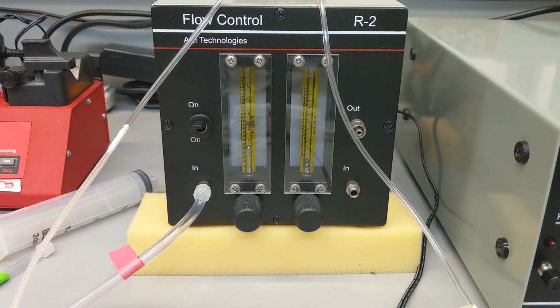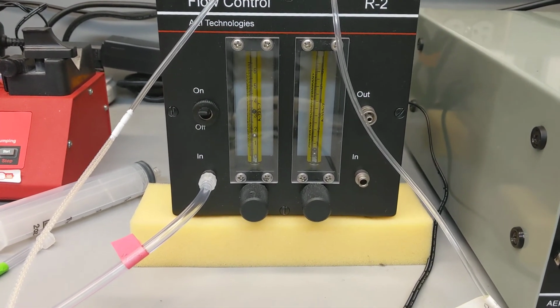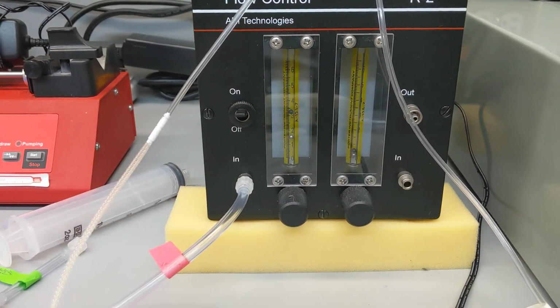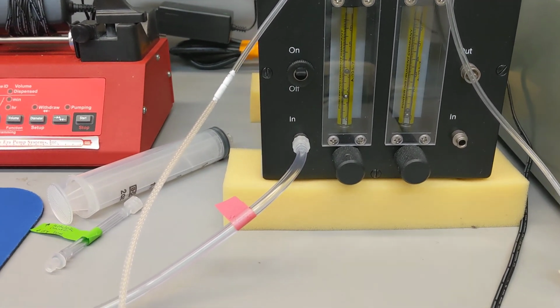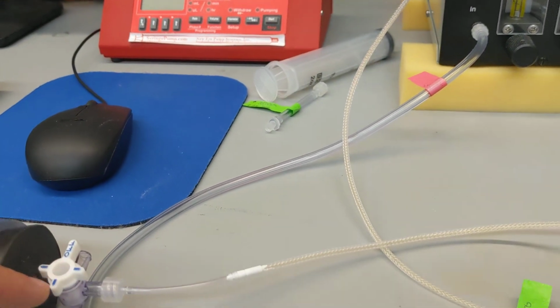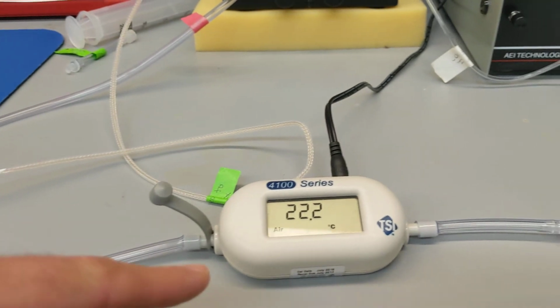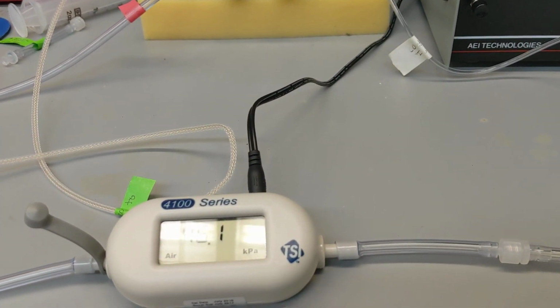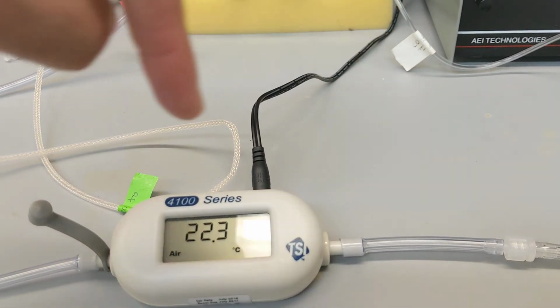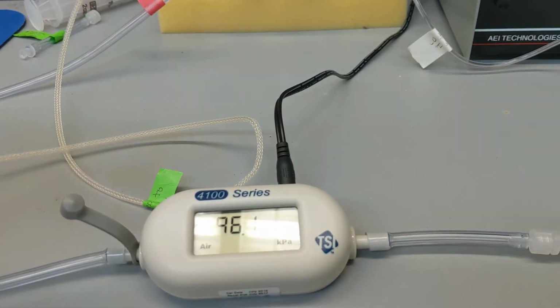So we're going to work backwards from this valve because air is going this way through this setup right here. So we'll work backwards and we'll find where the air is coming from. We're going to follow this thick tubing back. Air is getting pulled this direction, right? So it's going from the right of the screen to the left of the screen. It's getting pulled this direction right here.